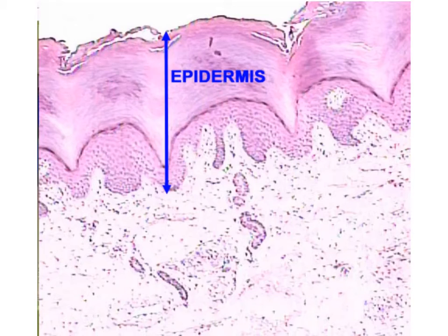With the sublayers of the dermis, and we can see the dermis from here downward, we will have them divided into 2 sublayers. So this indented area is known as the papillary layer of the dermis. It is within this area that we will find Meissner's corpuscle. It is also due to this layer that fingerprints form. And because these ridges are unique for each individual, we would have unique fingerprints.